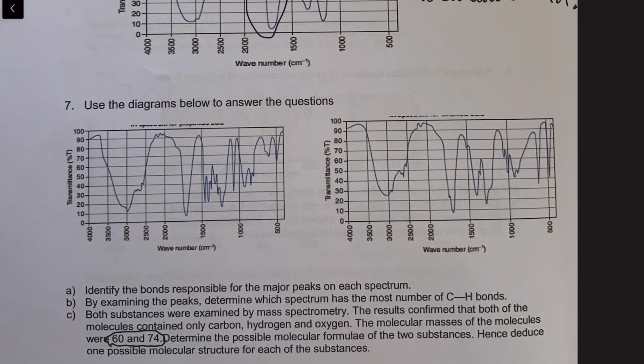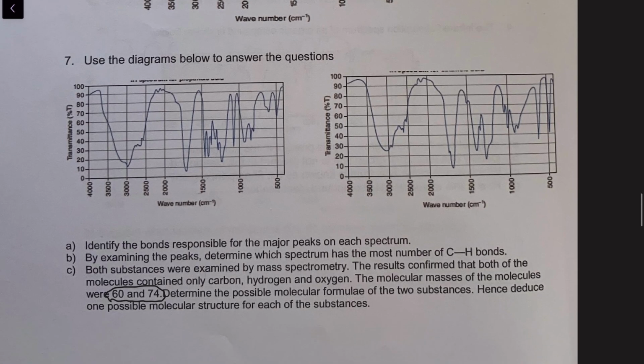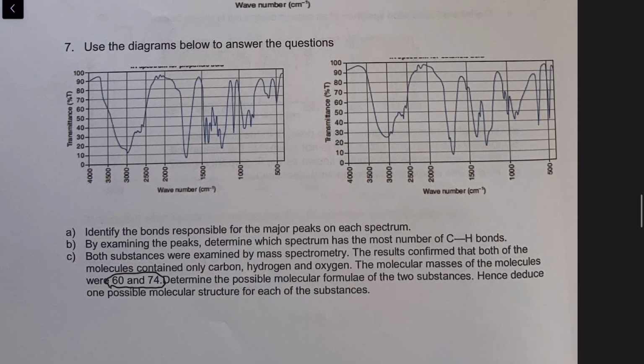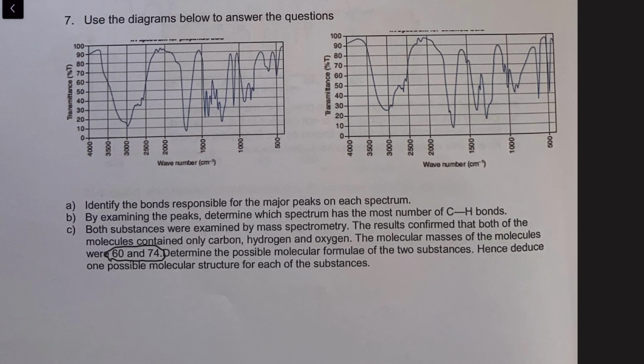The last question, question 7. Use the diagrams to answer the questions. Identify the bonds responsible for major peaks on each spectrum. You can also call this peak or trough, it doesn't matter, as long as you are making yourself clear. Also, I want to emphasize that the wavenumber goes from large to small.